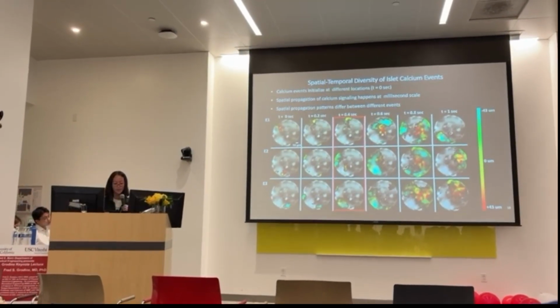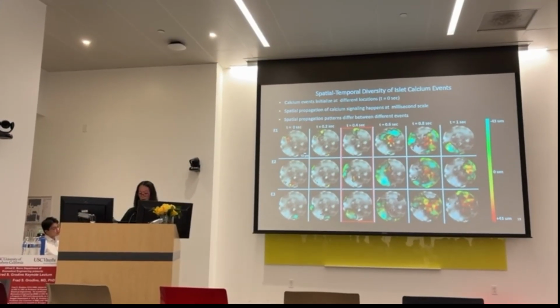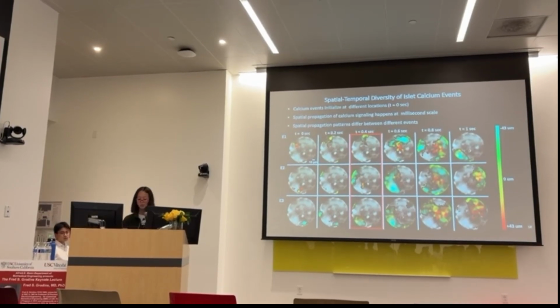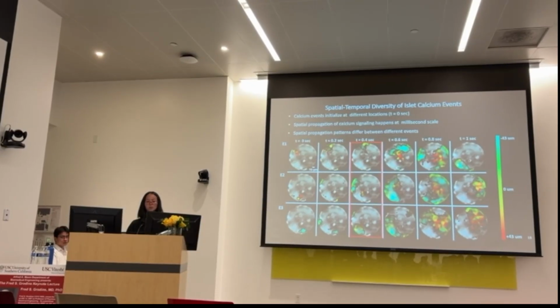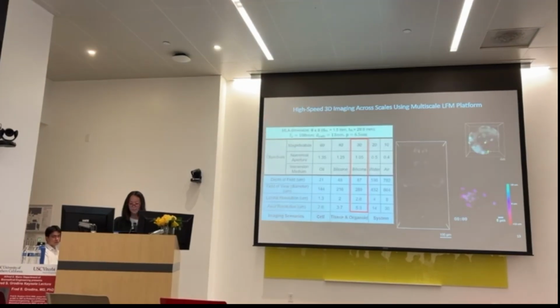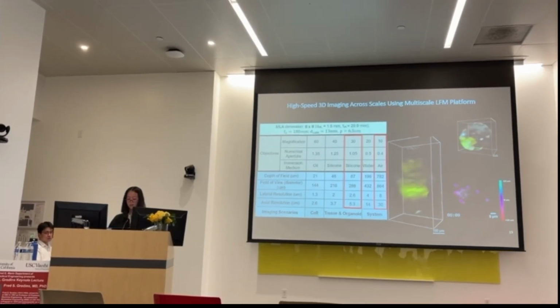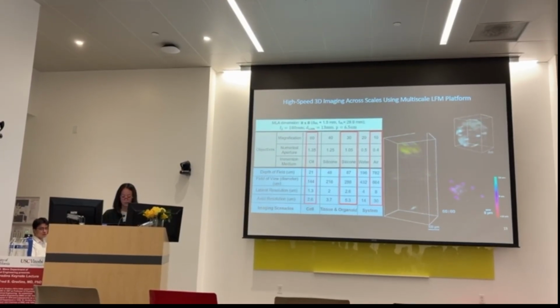And this is actually quite an exciting result because the diversity of these flashing dynamics is an area that remains underexplored and could potentially provide new insight into islet function. And we hope that as light field imaging enters the islet research community, it will deepen our understanding of islet biology and diabetes and ultimately contribute to the development of new treatments. Apart from the islet, we also captured seizure propagation throughout the zebrafish whole brain using the 10x as the primary objective, and membrane protein dynamics in a single cell using the 60x.